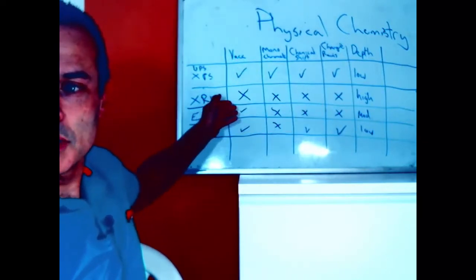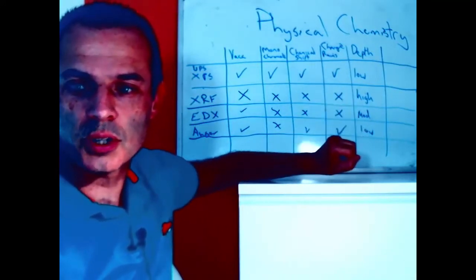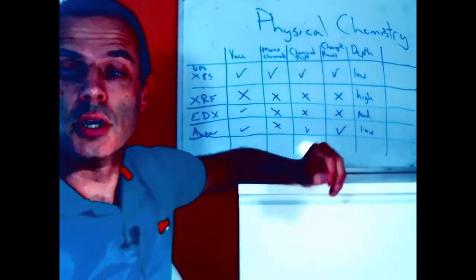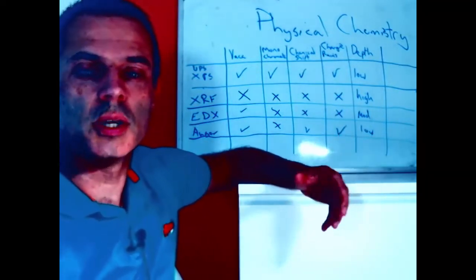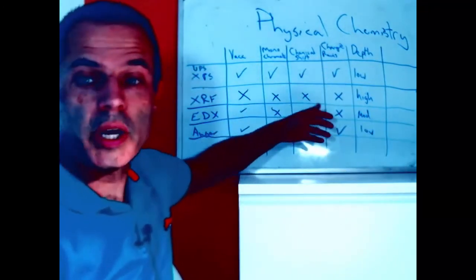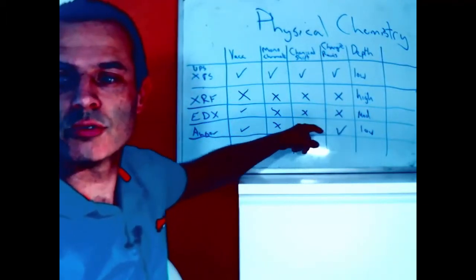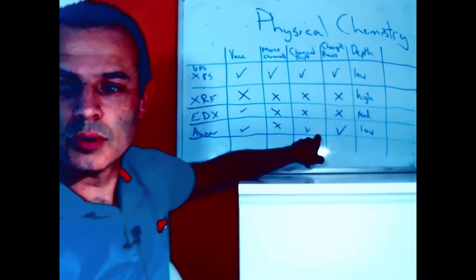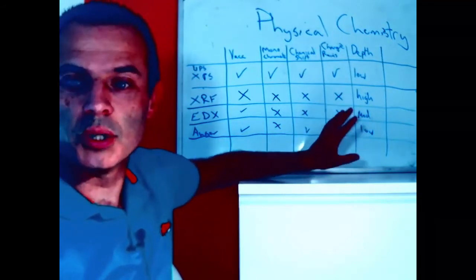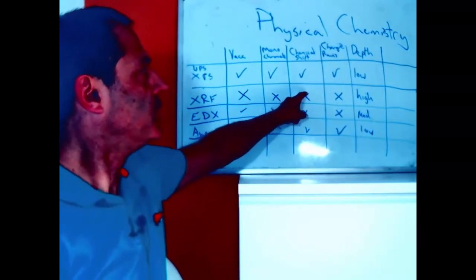Obviously, the ones that measure less chemical information are powerful if we don't know what the sample is, and the ones that measure chemical information are powerful if we need to know what they're attached to. If we have a good idea about what the chemical is that we're using, they are better because they tell us more information, but we can't extract that from the depth. So then we need to do something to make sure that we're measuring bulk material if we need to measure that.